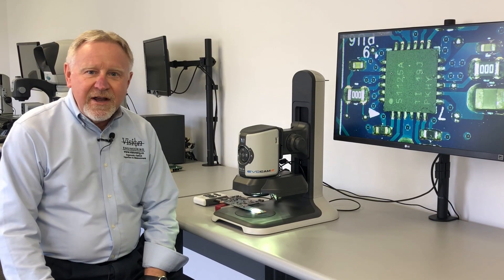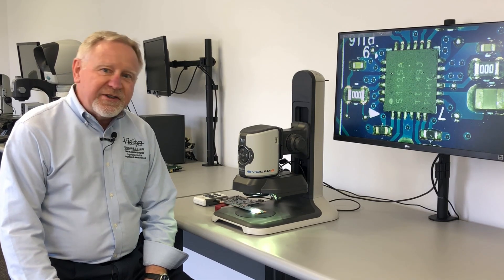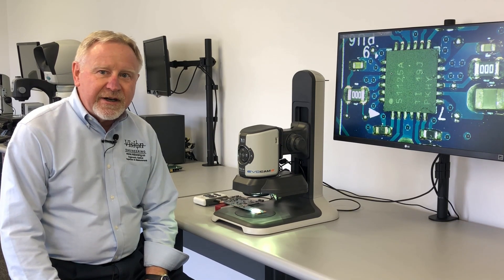Hi, Gary Elm here. Today we're reviewing the EvoCam 2 digital inspection system by Vision Engineering.